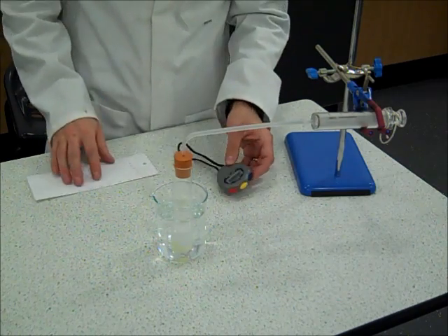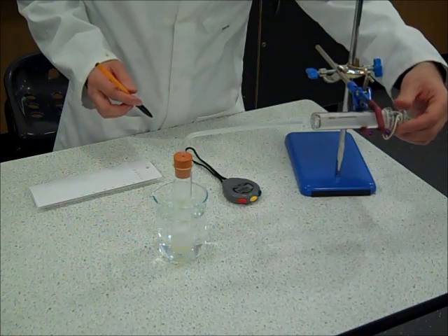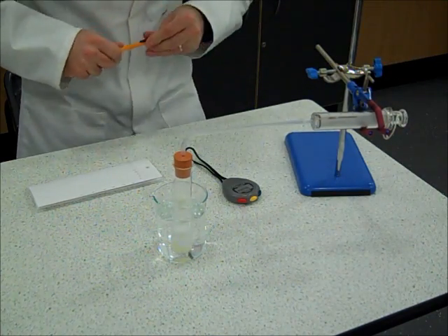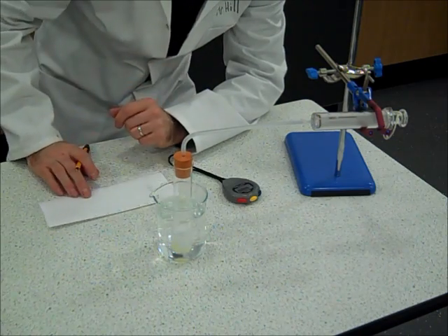I'm going to start a stopwatch and record the amount of oxygen that's produced every 10 seconds. You can see there the gas syringe has started to move and you might be able to see some bubbles of oxygen being produced within the tube.